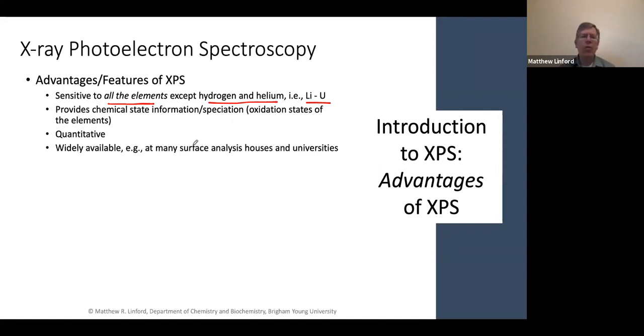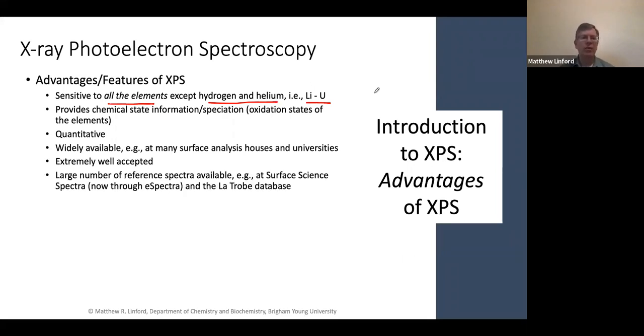XPS is really quite widely available. Lots of universities, many large companies, many surface analysis houses, they have XPS instruments. XPS is extremely well accepted. If you tell somebody, I'm going to go do an XPS analysis, everybody understands that's a very well-established technique. You're not going to get any pushback of people saying, why are you using that strange niche technique? It's not like it's unproven. XPS is really standard and well accepted.